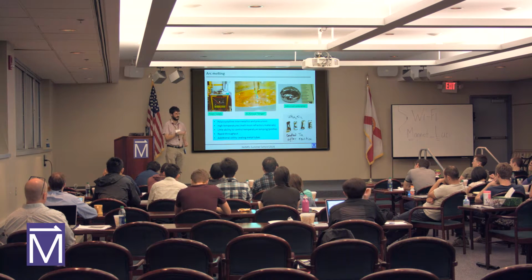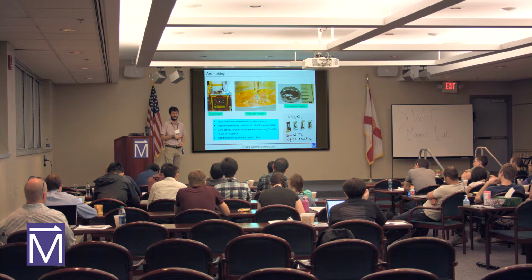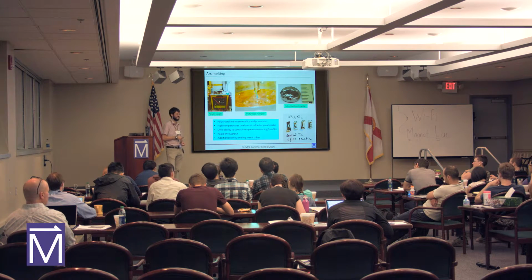Yeah, we've done it with phosphorus before, for instance, and we can do it with gallium and tin and all sorts of low melting temperature things. Yeah, you have to have an advisor that's willing to let you waste some tantalum in learning how to do it. Yeah. Okay. Okay. Further questions?